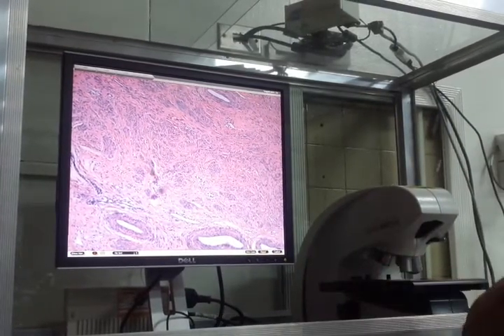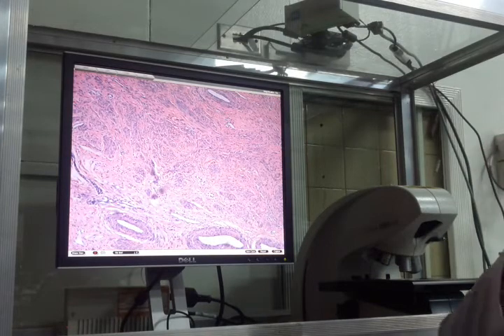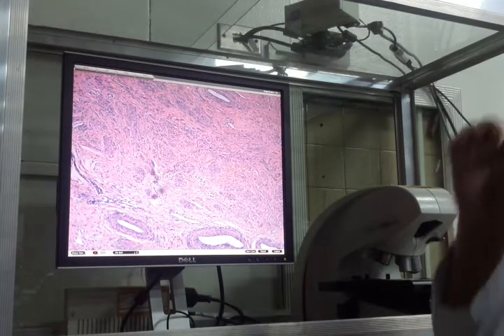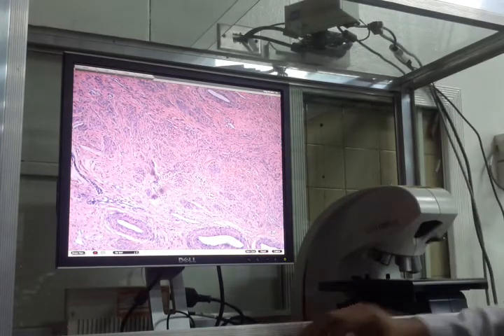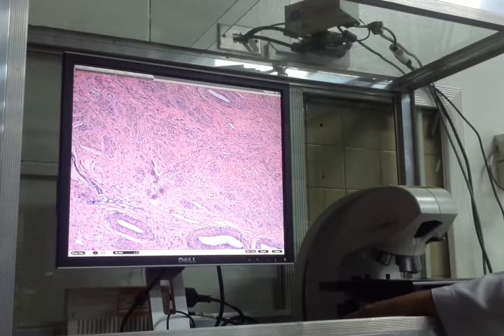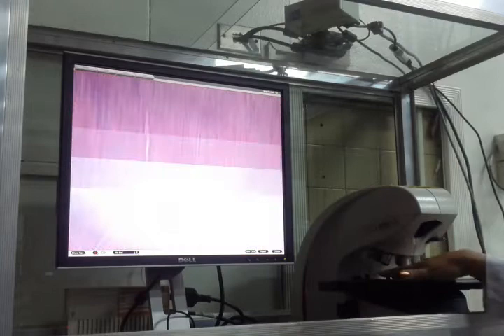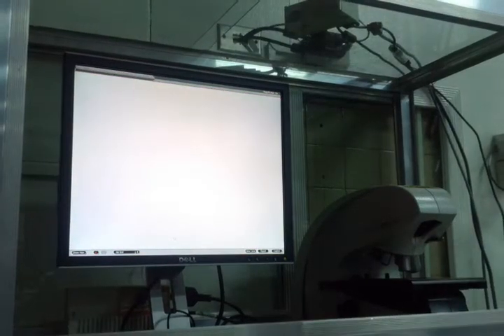So the portions in between the cells will usually grow fibrous bands, as what you see here. These are fibrocollagenous tissues. These are the muscles. And look at the blood vessels. They have thickened walls, because of too much fat eaten.